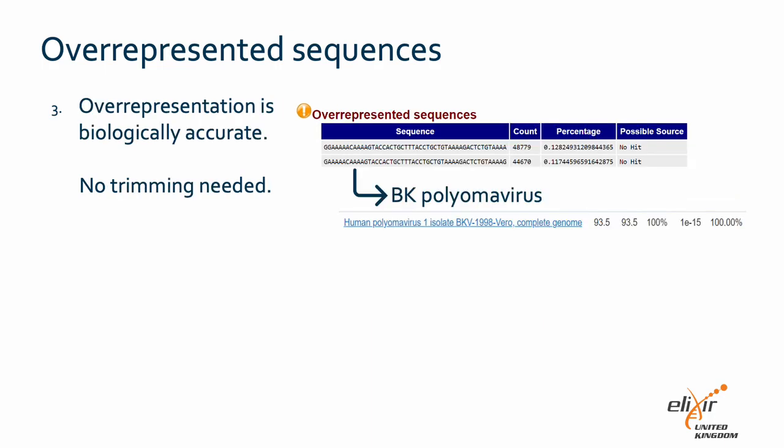Interestingly, biologically relevant groupings can appear technical at first. In this case, BK virus transcripts are massively elevated in this sequencing data, producing seemingly overrepresented sequences. It's always good to run any no-hit sequence back in BLAST before removing anything.